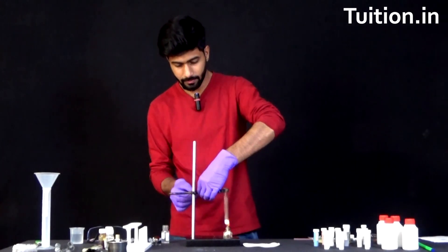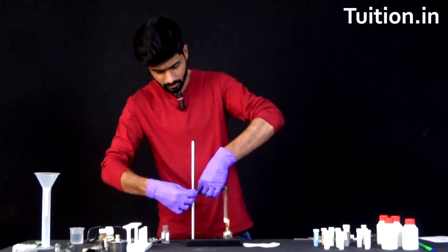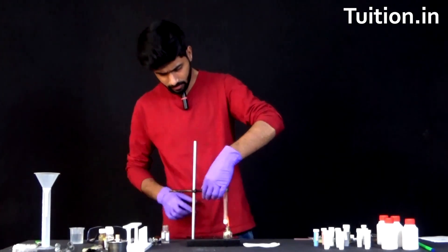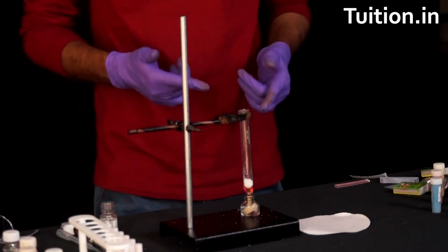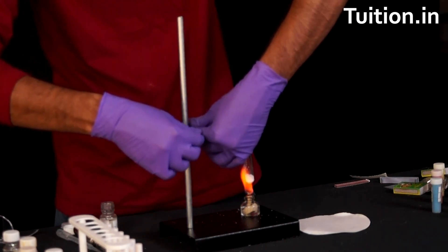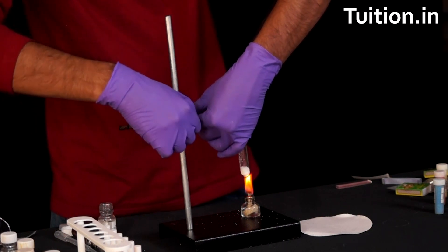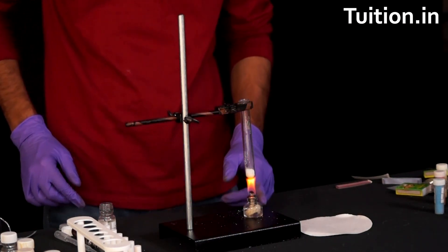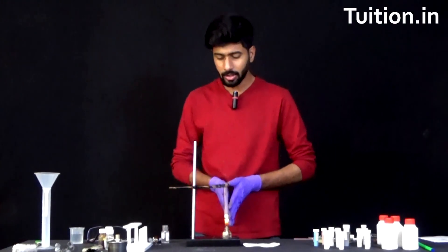Let's increase the height of the salt a little. As you can hear the sound, there are some fumes coming from the test tube. Let's see what all it consists of.